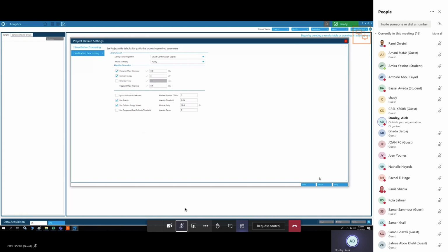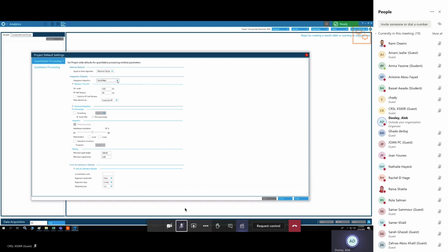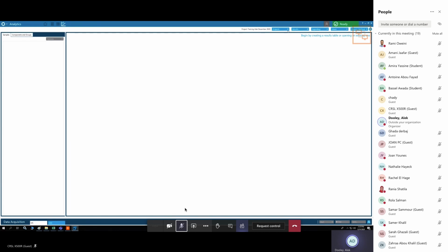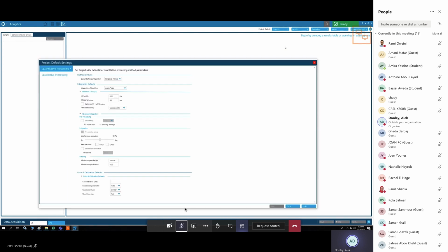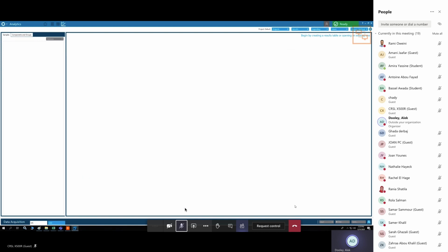I'm just going to save that, and also I will do it for the project that I set up. Then I will do it for your default project, and after that it should be done forever. All the projects that you make are born out of the default project. Just save that. Okay.